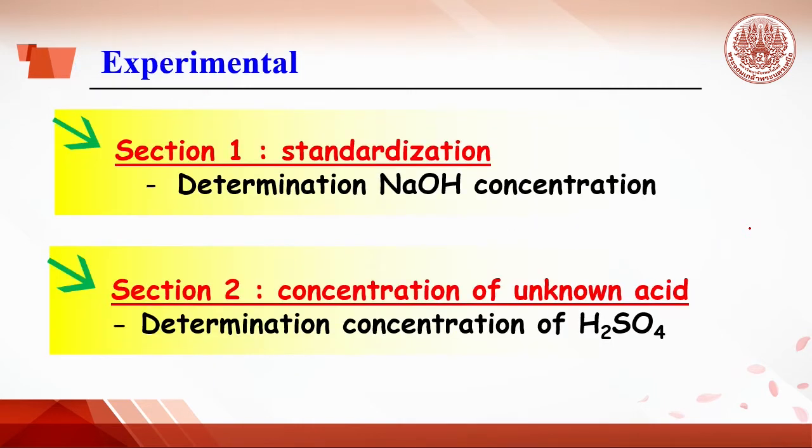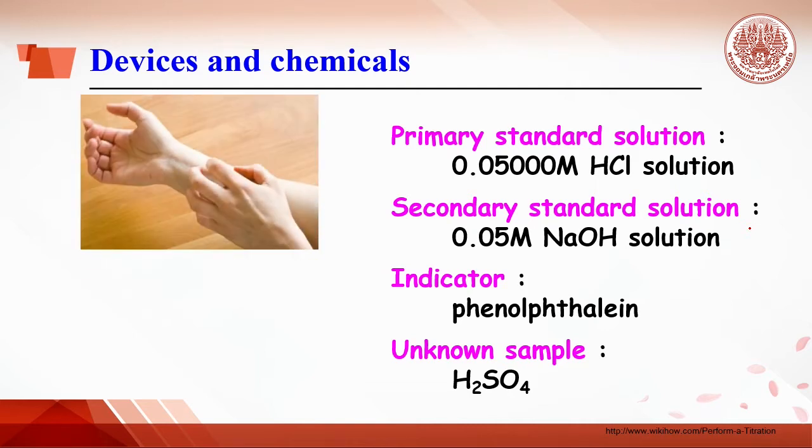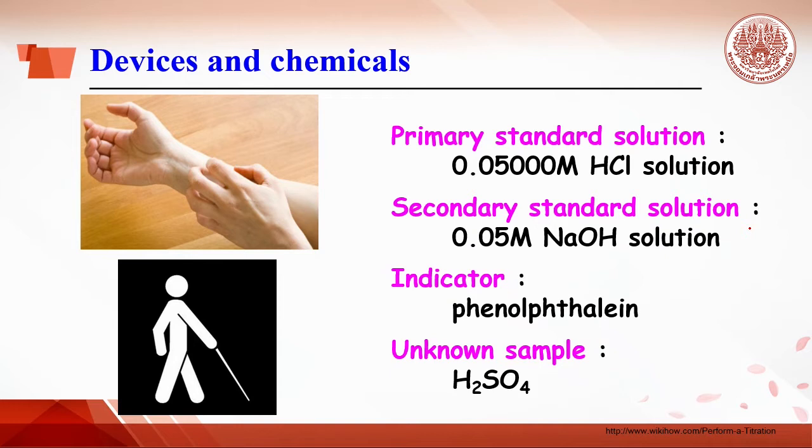Today, students will be allowed to do two sections. First, standardization to calculate the exact concentration of sodium hydroxide, and use it for section 2 to determine the concentration of an unknown sulfuric acid. Chemicals for today are irritants. Hence, if students feel itchy, please wash with tap water several times. Sodium hydroxide might cause burns, so please be careful and follow the instructions.